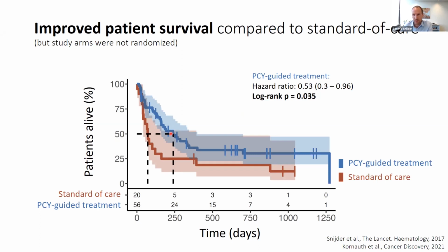Similar results are not available for, for instance, organoids, not available for plate reader-based screens or flow cytometry-based studies. And as such, we think that success is in part due to the image-based nature of this data. We can quality control this data very well, and we have this internal cytotoxicity readout.